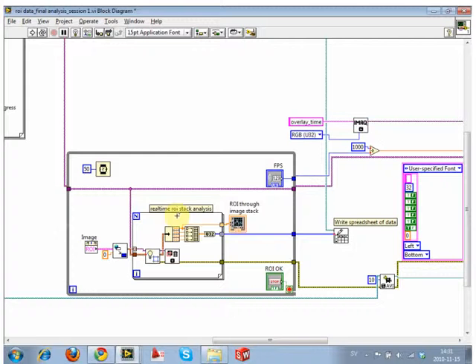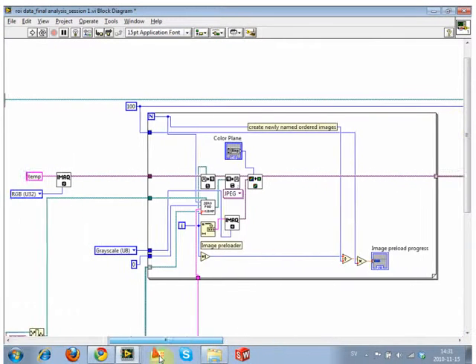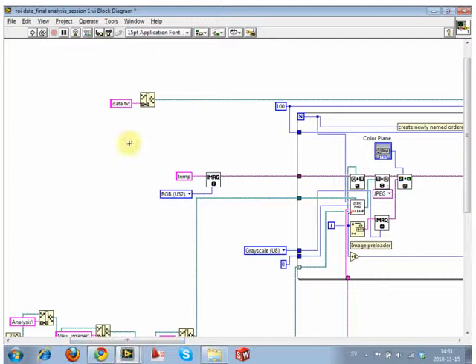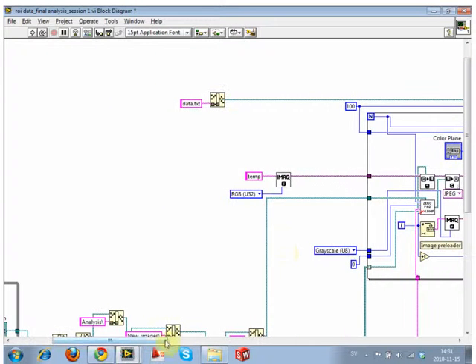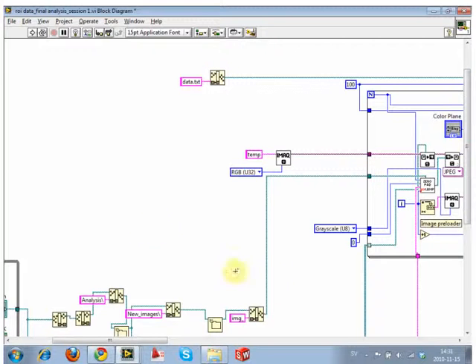Like I said, you're going to have to watch it a little bit. One thing that I just noticed is we didn't wire up this guy, so we'll wire up this guy too. So we want to put this in this directory.